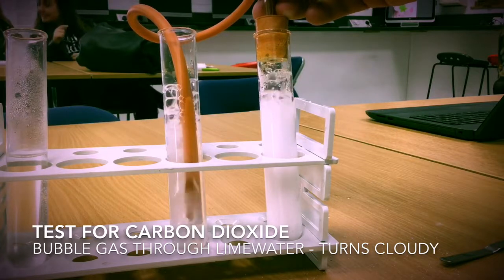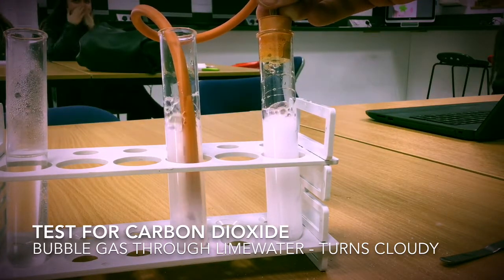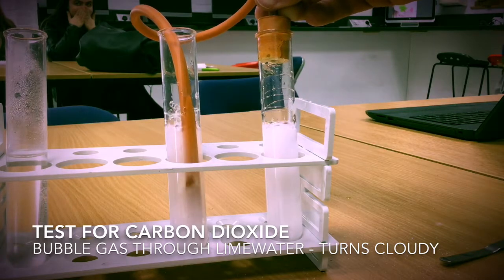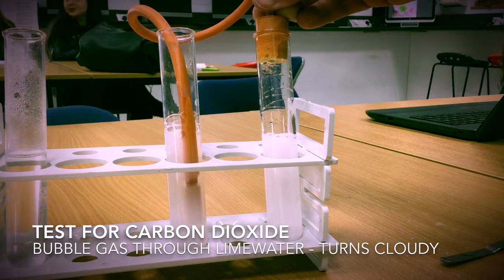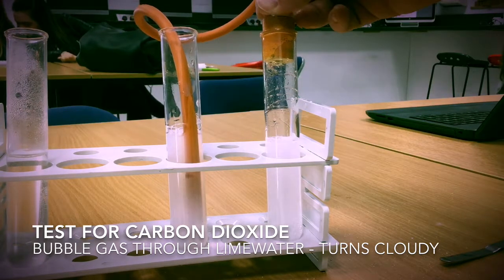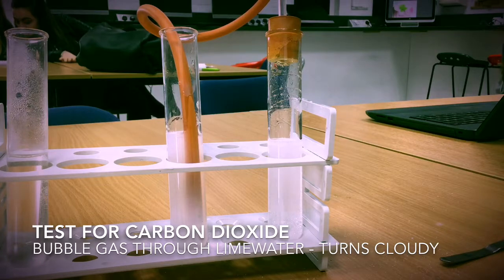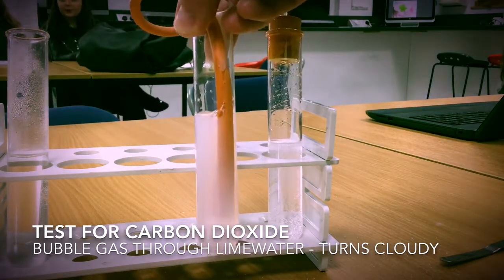We are looking for the lime water to turn cloudy in colour — a positive test would turn the lime water cloudy. As you can see, the lime water has gone from clear to cloudy in colour.